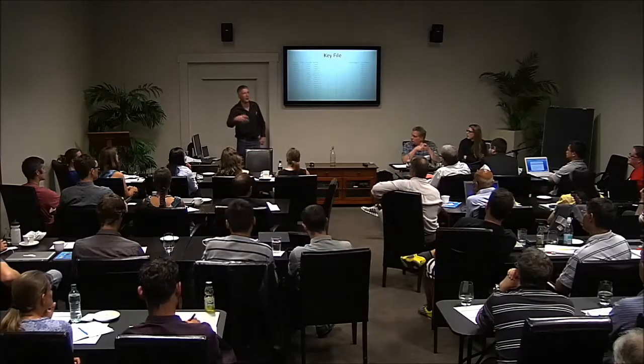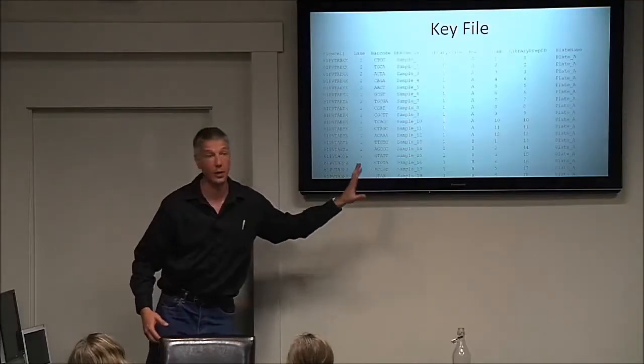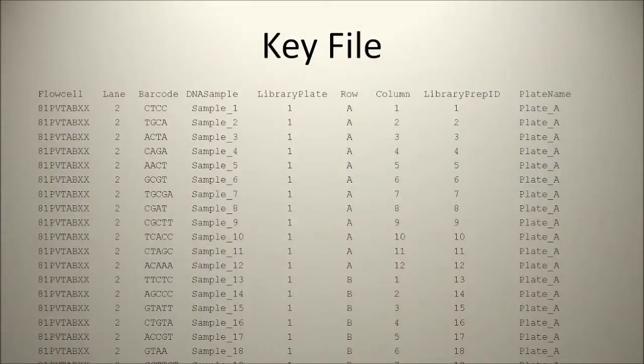And I've run into this problem before, and so there are a lot of fields available in the database that the IGD is using, the HTS database, that I wasn't using, so I fudged it and collected that information in a field that I wasn't already using. But if you're building your own system, you can build that into the system, right? Yeah. And this is all around our talk about Kia and other things, and what do we do to generate this stuff. But it's really important that you do it and you store it right, and it can be double checked and so on. Yeah, one definite usage of GBS is to find errors like that.